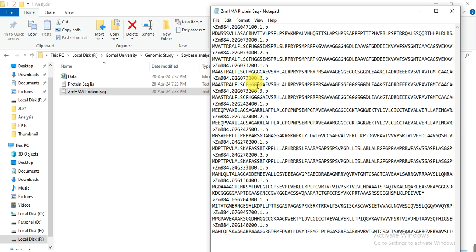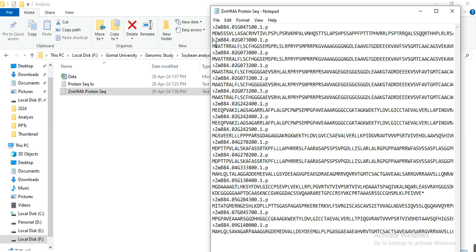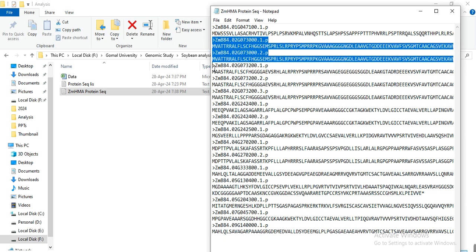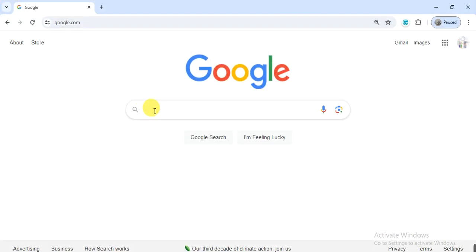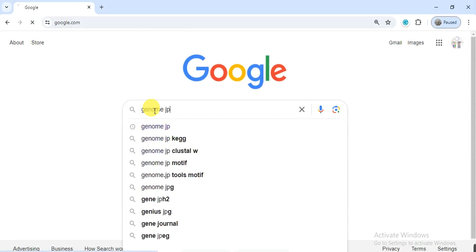We will do alignment, and through alignment we will confirm whether there is any difference between two transcripts or not. First, select the two transcripts of this gene, copy them, and go to the website genome.jp.